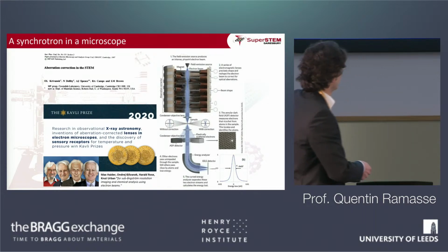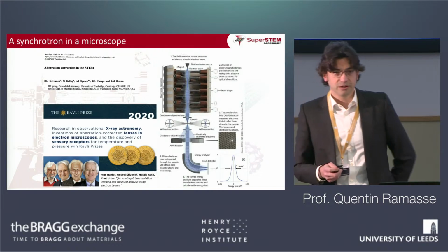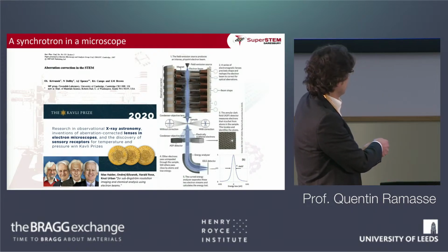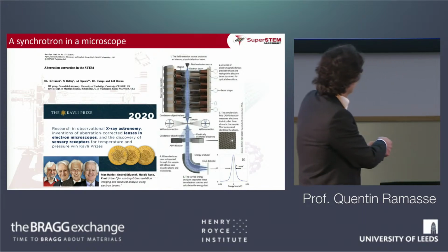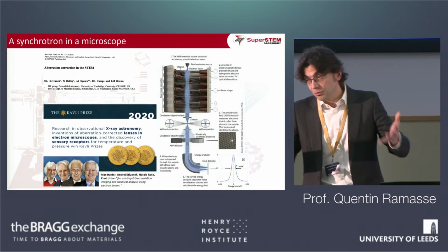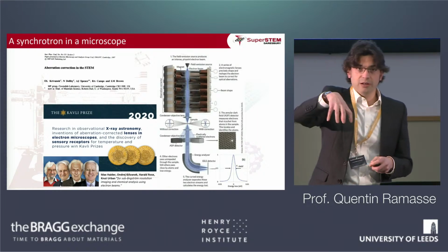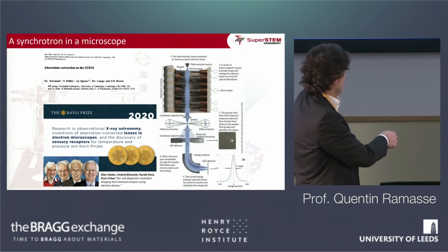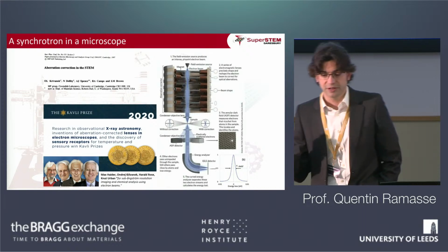And one of the good examples is shown here, a sample that is rather dear to our heart because we've looked at it for a long, long time, and that's a single silicon atom, this really bright dot here, that's been embedded into a lattice of graphene. All of the not so bright dots that you see arranged in a hexagonal fashion there are single carbon atoms, graphene, and then one of the carbon atoms has been plucked out, and a silicon atom, an impurity, basically just replaces the carbon atom, and of course you see it like a Christmas light. So that's just on the simple imaging side. We'll go through quite a lot of that.